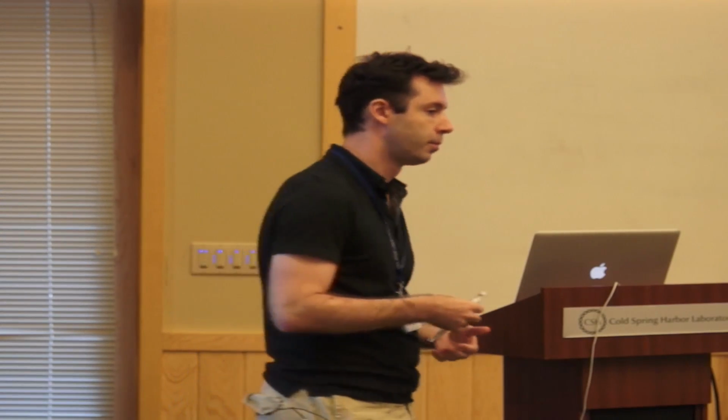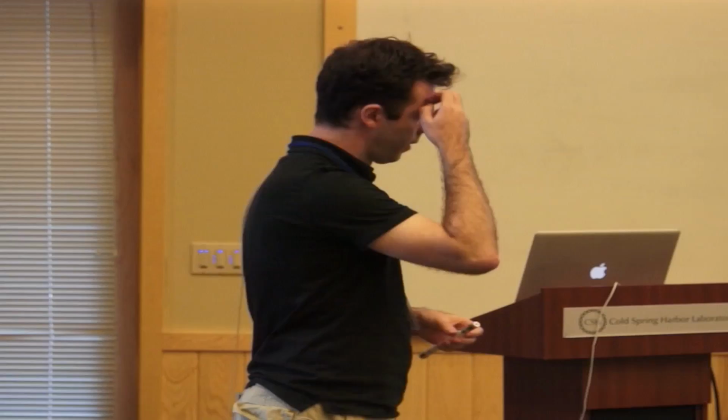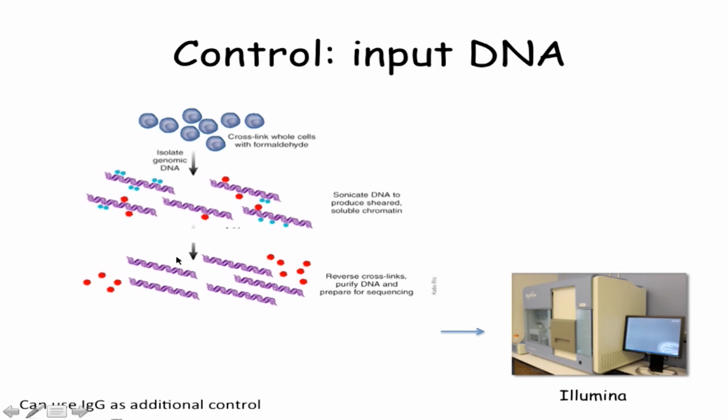Yeah. So there are some sequences that get over-amplified during Illumina processing, for example. So if you see the same peak in the ChIP and in the input, it means that this is not enrichment coming from the antibody, but just a property of that sequence. That's right. This is one of a set of reasons why you want to do this experiment: some of these steps, including the sequencing, do involve some enrichment. And it's not only the sequencing, it's also isolation of DNA and sonication.